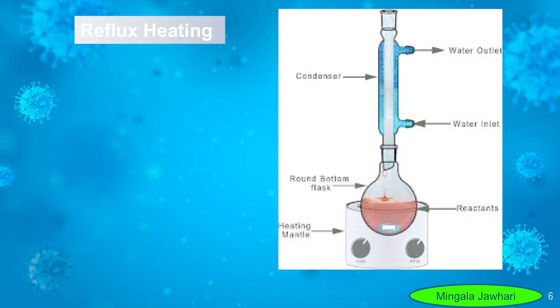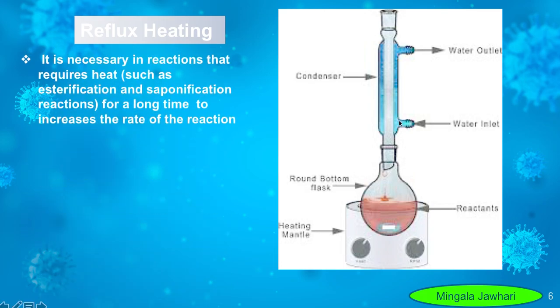And in this case, we will achieve the yield expected. So this type of heating is used in reactions which are already slow, such as esterification reaction, and I hope we will return back soon to school in order to prepare this reflux heating in the lab, and we will do saponification reactions.